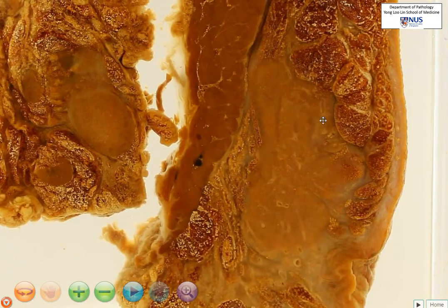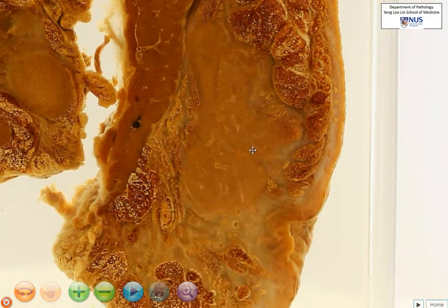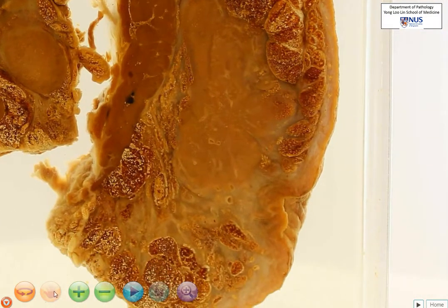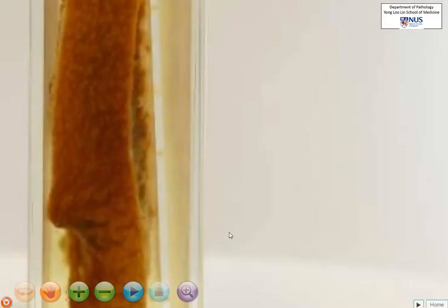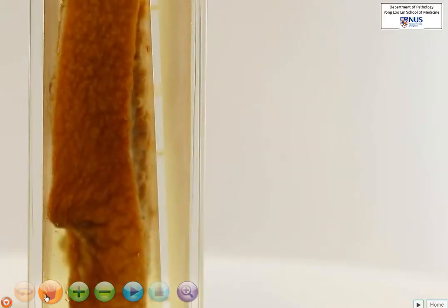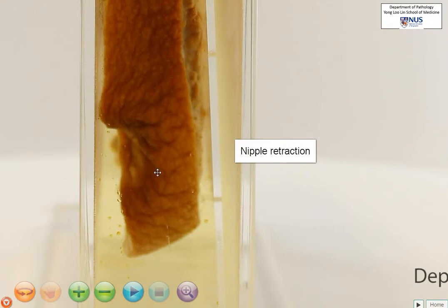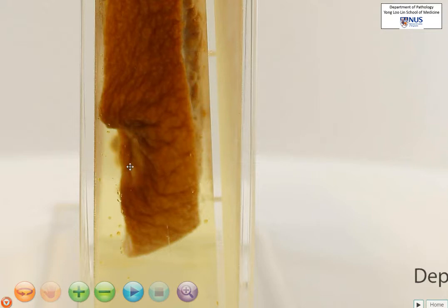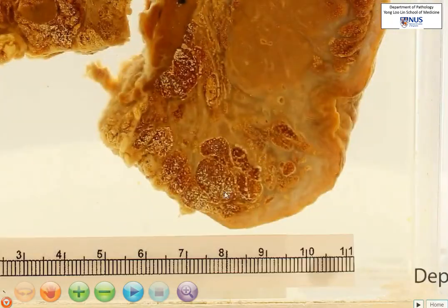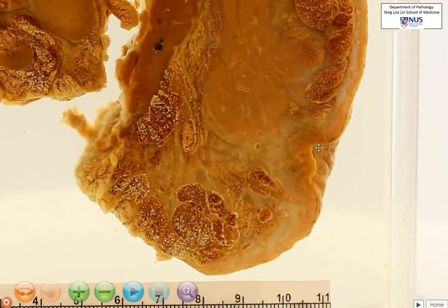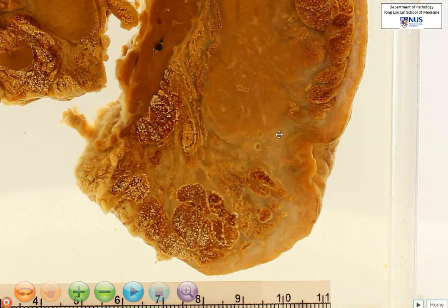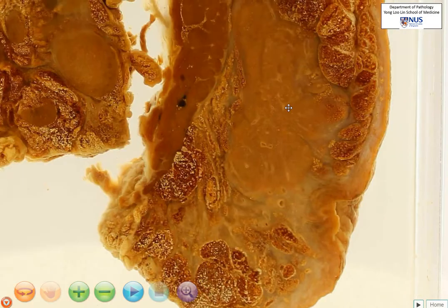Here is the mass on this surface. Is it going into the skin? We can see that the nipple appears to be retracted here, and this is possibly one of the clinical presentations that this patient may have. However, I do not see that the tumor is directly invading into the skin. As you can see over here, it is not going right into the skin.